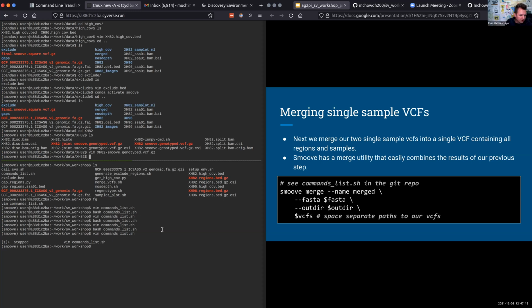So the other critical step in this merge process is to identify structural variants that are common among the samples. And this is a little bit of a tricky process because in many cases, especially in short read data, structural variants are not identified down to single base resolution. There's going to be a confidence interval around the breakpoint. So you might know the breakpoint is between two sites plus or minus 10 base pairs. And so this merge is aware of that ambiguity between calls and merges things as long as they are reasonably the same structural variant.